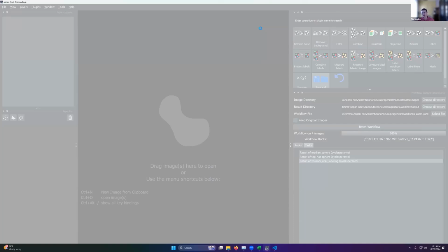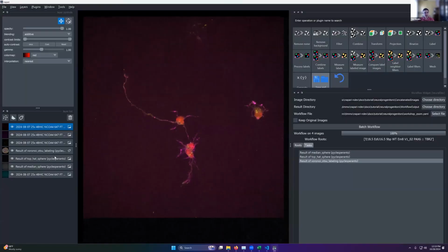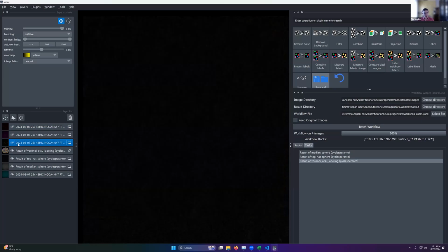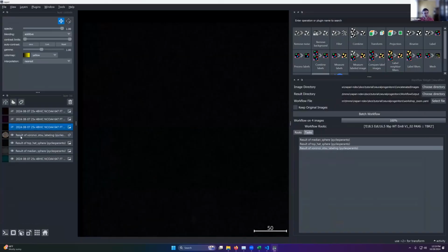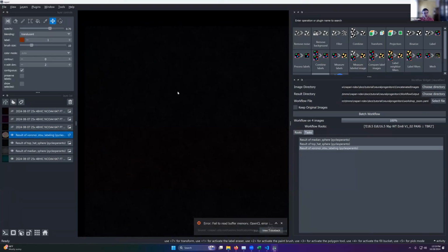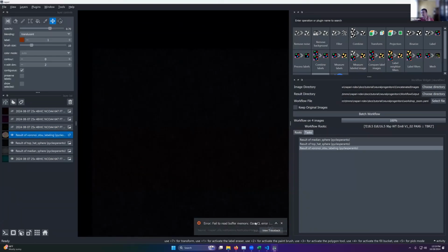Yeah, I'll wait a second to see if it uncrashes Napari. If your Napari ever does this, this is because it's thinking. Yeah, it seems like, oh no, it did do it. Okay, so you could see this is why it was chaos. So it tried to run the first channel that opened. So it tried to do that process that we did on that first channel, and ultimately that resulted in, wherever it is, failed to read memory buffer. Yeah, this really broke it.